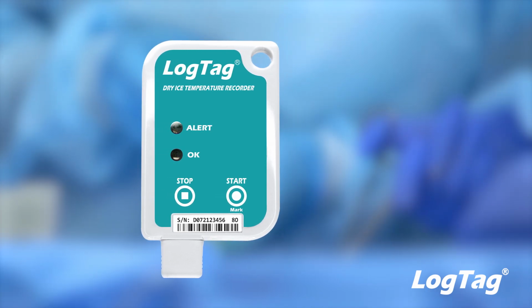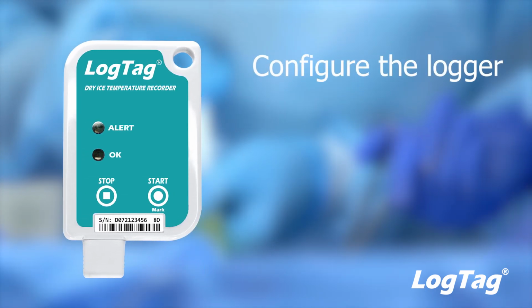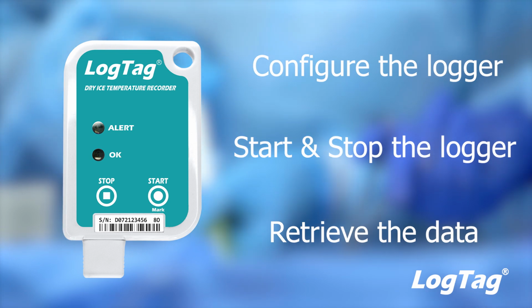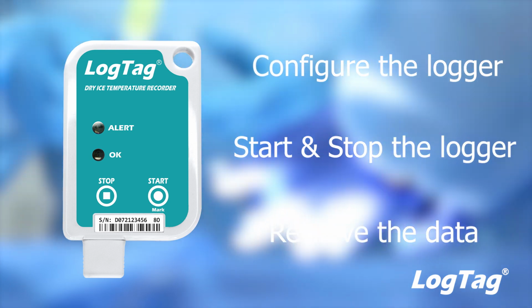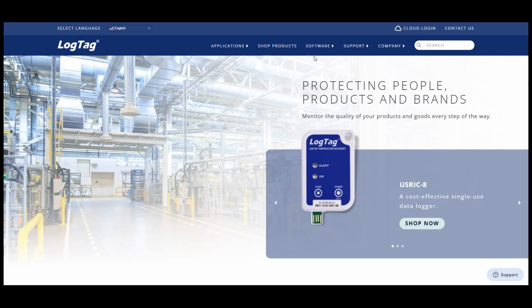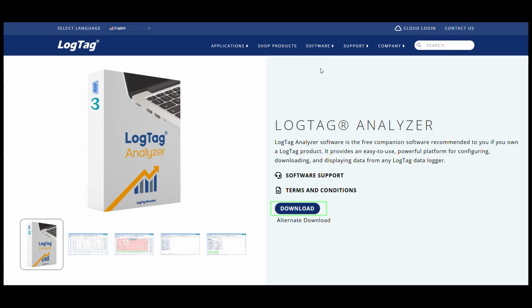In this tutorial video, we will cover how to configure, record, and retrieve the data from your TRIL or SRIL-16U. To configure the TRIL or SRIL-16U, you will need a Windows PC running the latest version of LogTag Analyzer, which is available for free download at logtag.com.